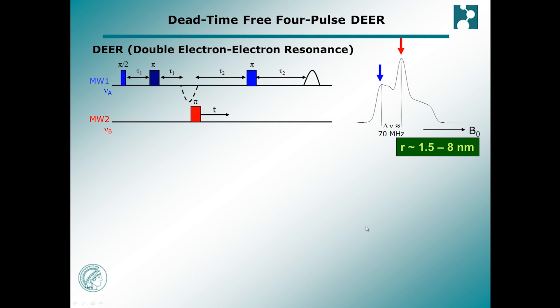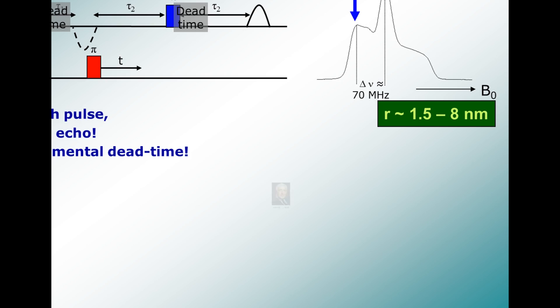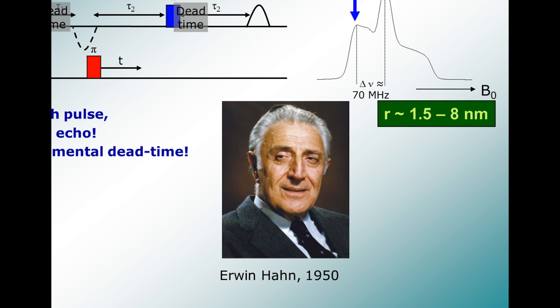In order to record DEER spectra free of artifacts, the dead time that inevitably follows pulse excitation has to be overcome. We solve this problem by simply adding a refocusing pulse that creates echoes which occur after the dead time has elapsed. This approach is well established in NMR and is based on the ingenious work of Erwin Hahn back in the 1950s.